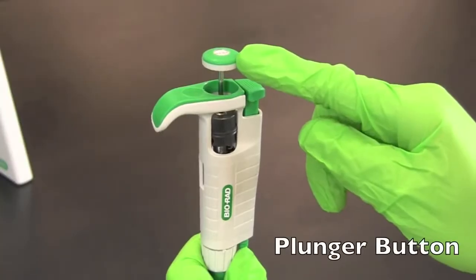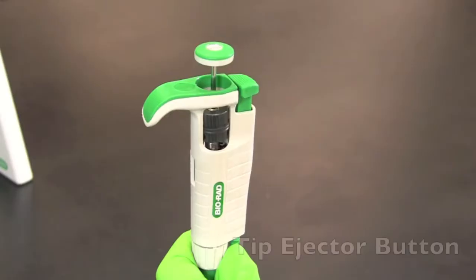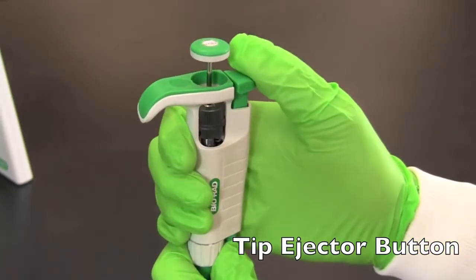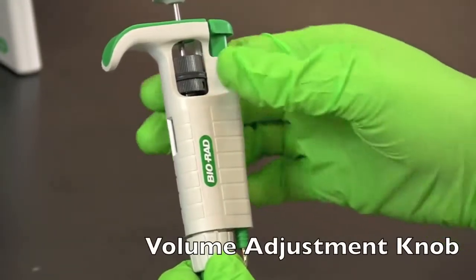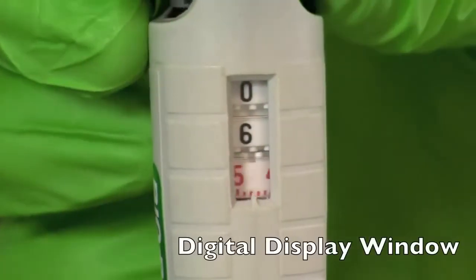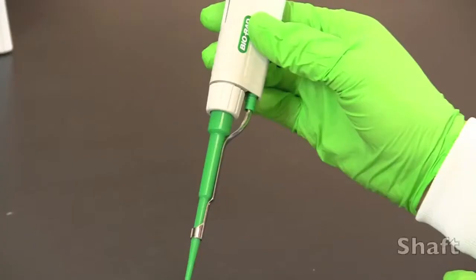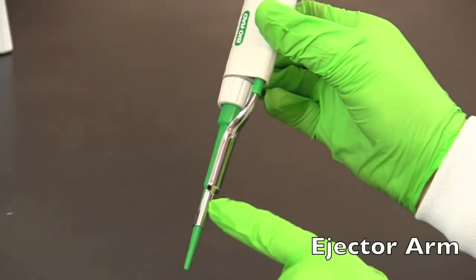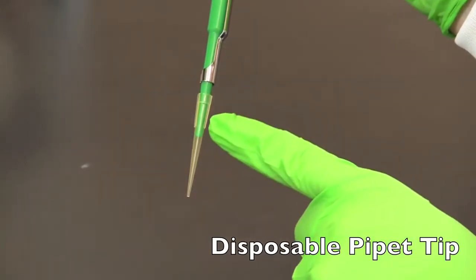The parts of a micropipette include the plunger button used to fill and dispense samples, the tip ejector button used to remove used tips, the volume adjustment knob used to adjust the volume you wish to transfer, the digital display window that displays the volume being selected, the shaft, the ejector arm which ejects used tips, and a disposable pipette tip.